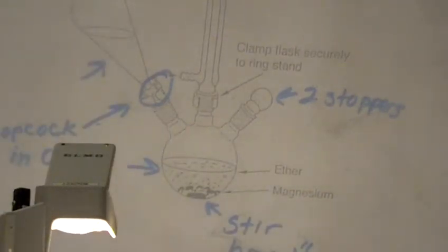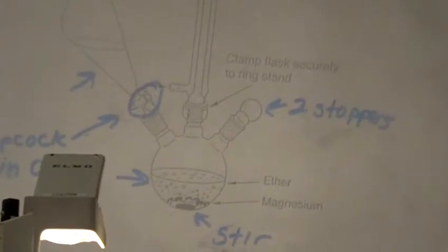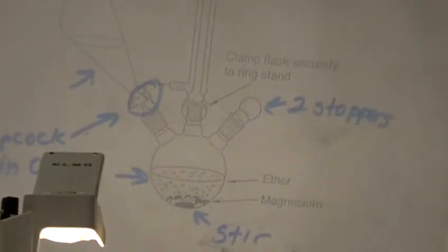all right? The other thing with this setup, we are not stirring. We have not started stirring, and the reason for that is we don't want to bring water and oxygen from the atmosphere into the reaction, okay? So no stirring yet, all right?